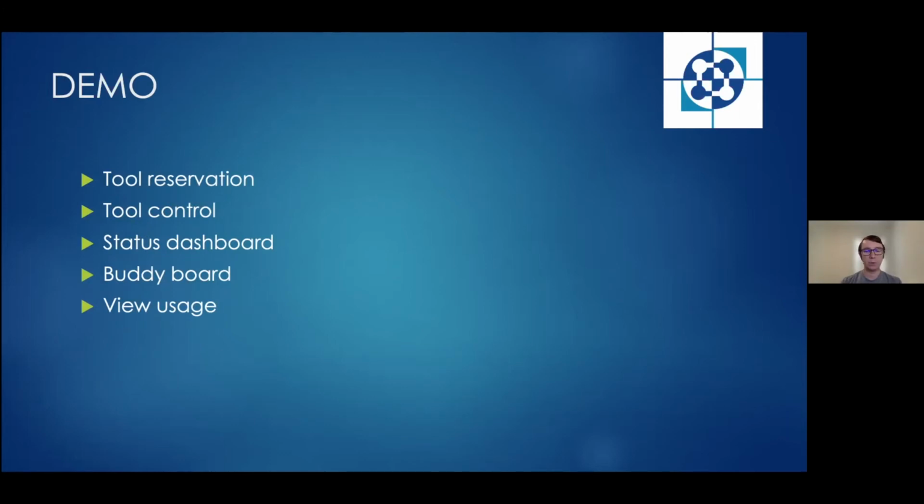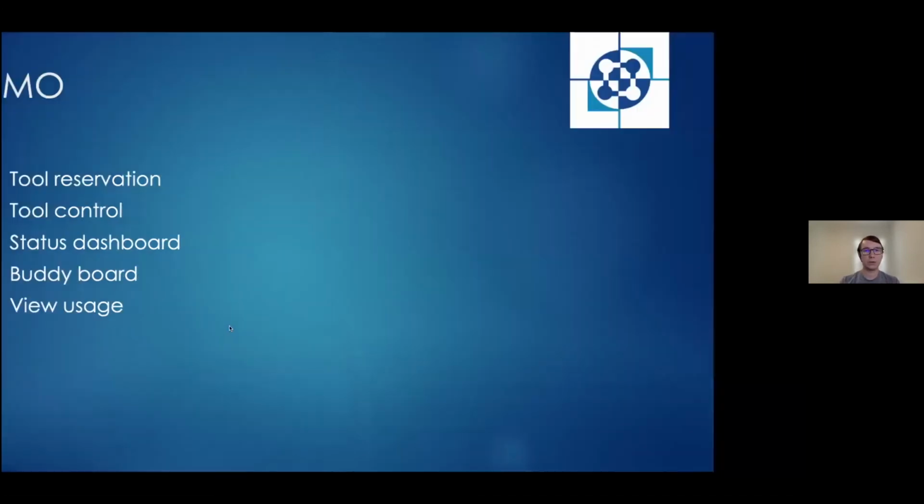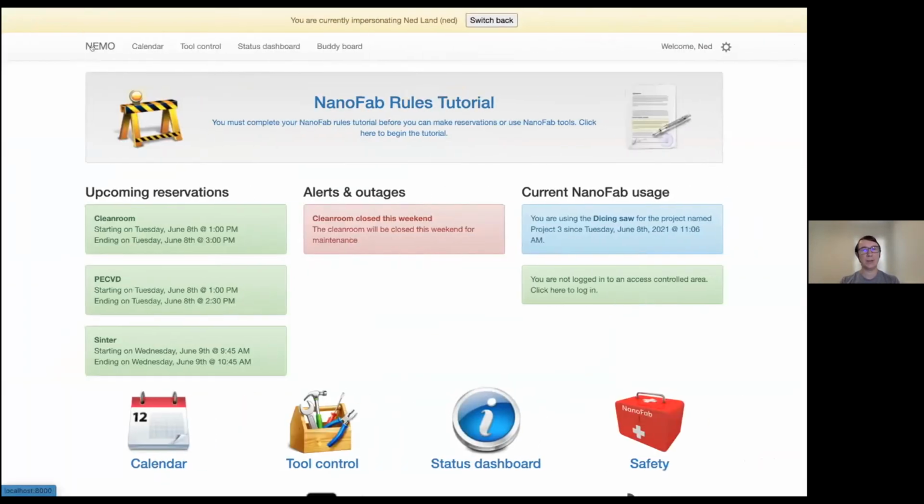But you'll see from the user's perspective what the setup of this configuration looks like. So I will switch over to NEMO. So this is what NEMO looks like. The first time you would go in, the first user, once they've been added, maybe not all of this, but they'll see some of that stuff.